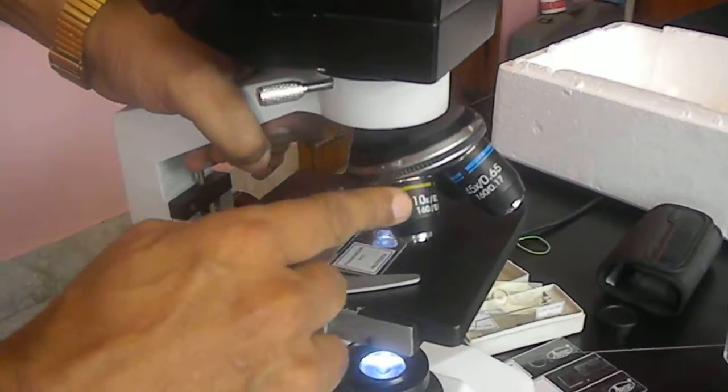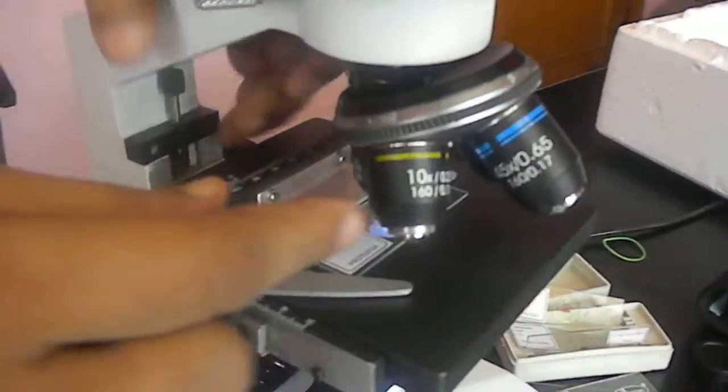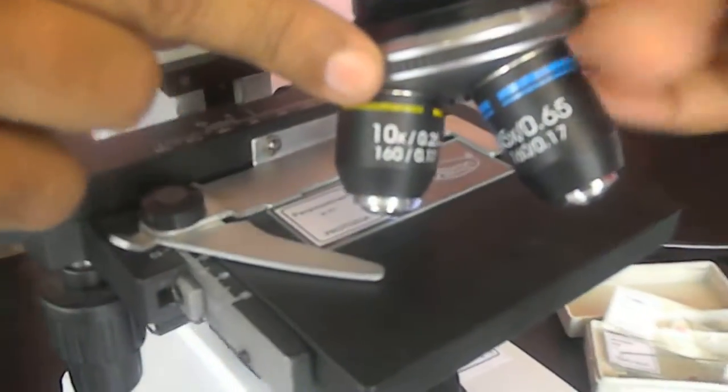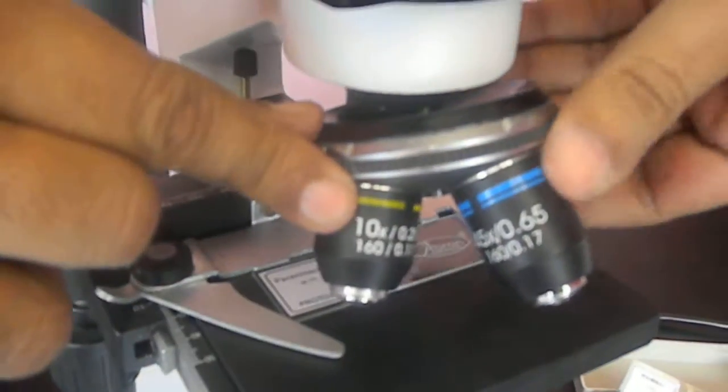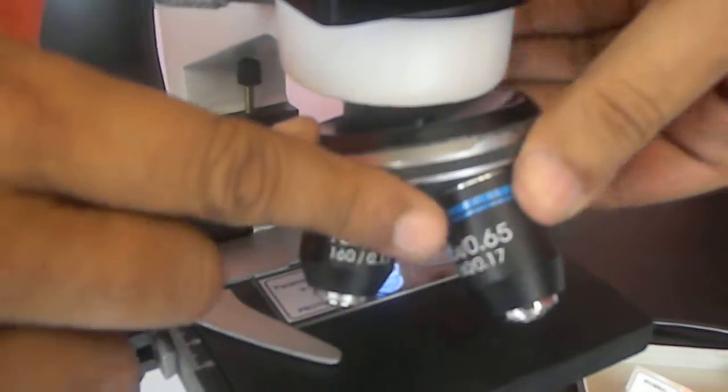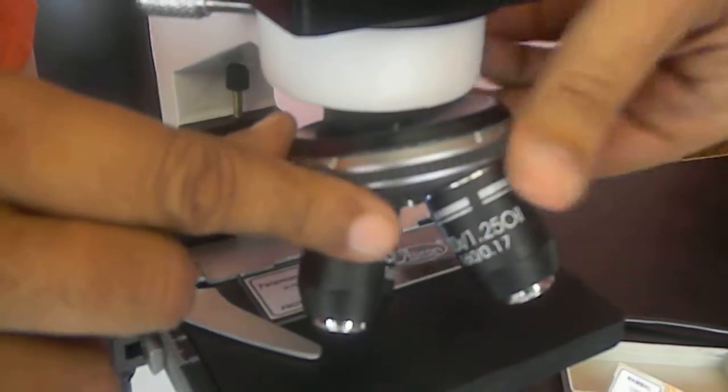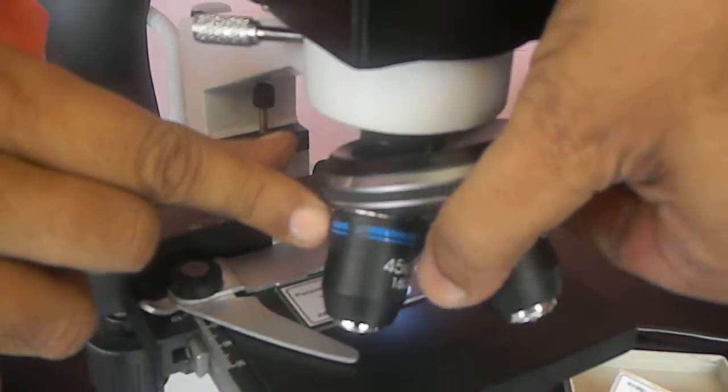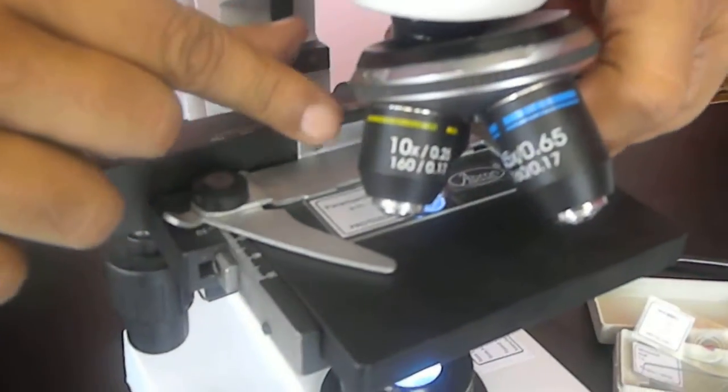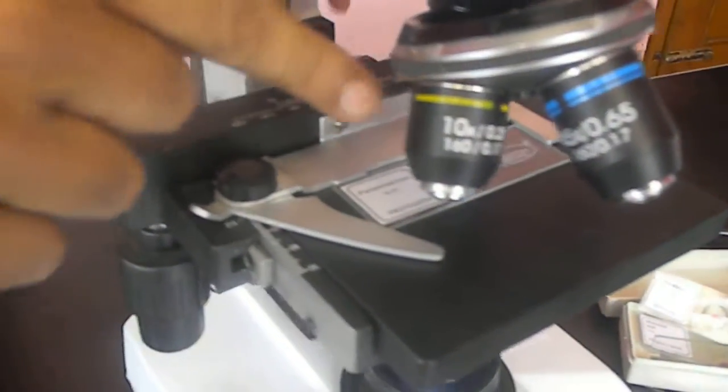Objectives are there. 10x, 45x, starts from 5x, 10x, 45x and 100x. Four objectives are there. We will start with the 5x objective.